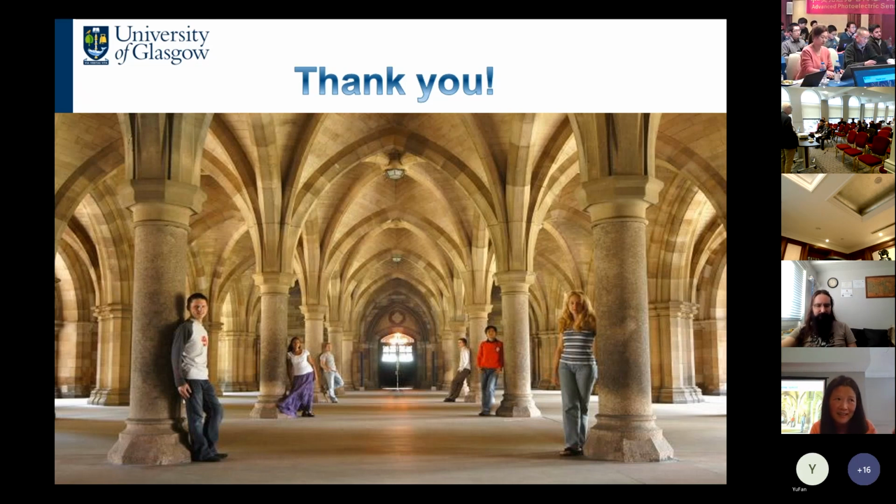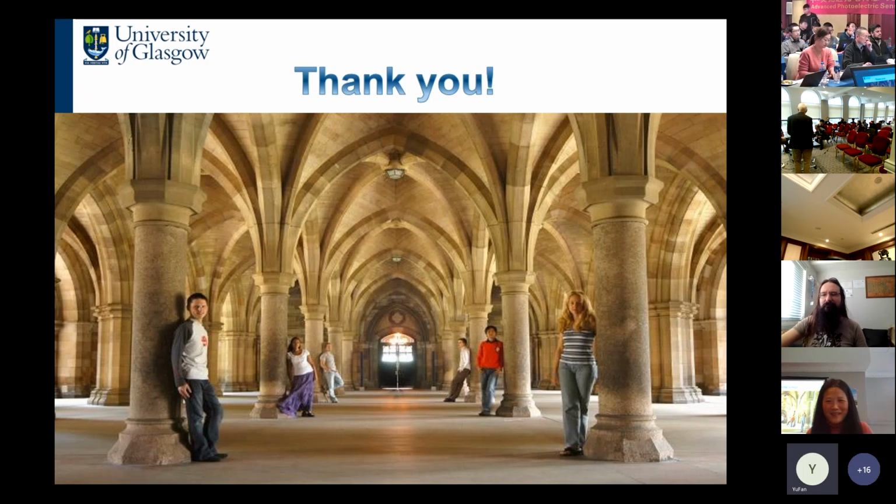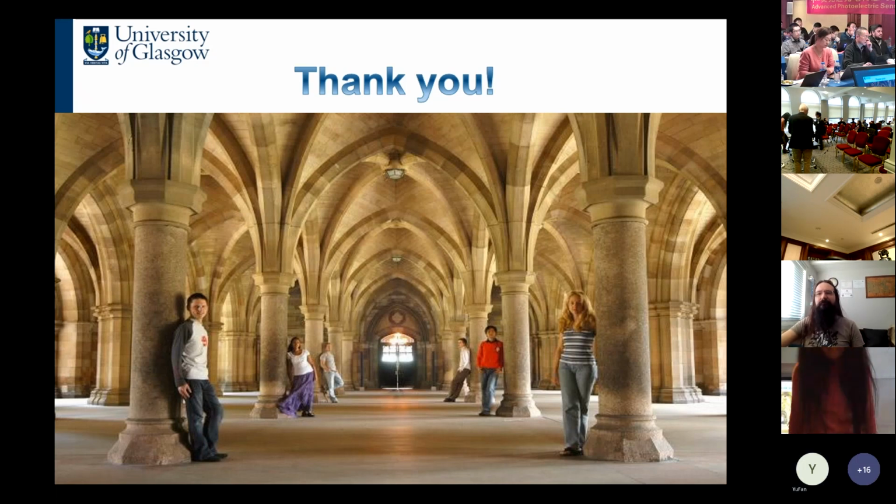That is the signal that is very expensive. But that's new technology for the continuous laser. There's no pulse laser. There's another technology that uses a cheaper laser diode, a CW continuous laser, to do the stimulated Raman. If that can be achieved, that would be fantastic. There are a lot of advantages in terms of high throughput, right? And that would be fantastic. We have a good idea. Potentially we can. Okay. Thank you. Very good. No problem.